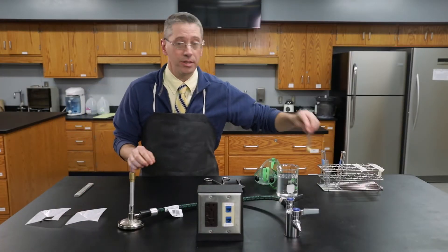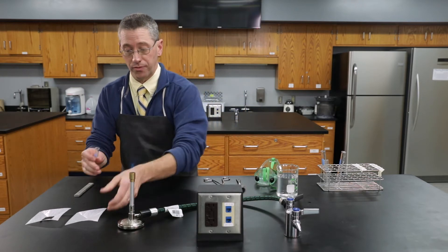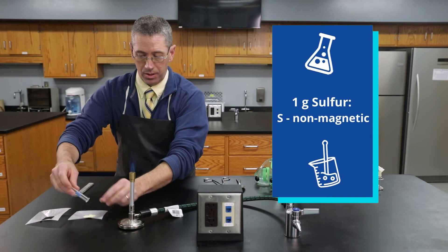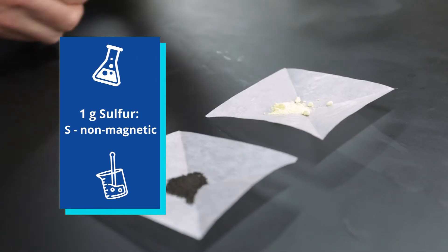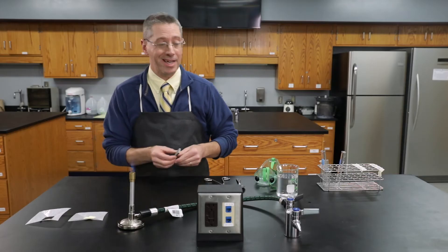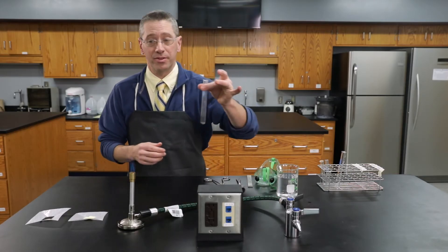Our second element is going to be 1 gram of sulfur which is a yellow non-metal that is not magnetic. We're going to react these two together to make iron sulfide inside of this test tube.